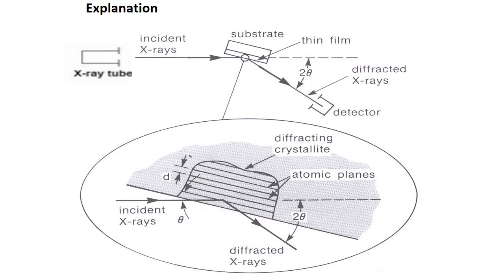The diffracted light is going toward the detector, and the detector gets that light and gives the pattern of diffraction. By using the information given by the detector of the diffraction pattern, we can get the structure of that substance.